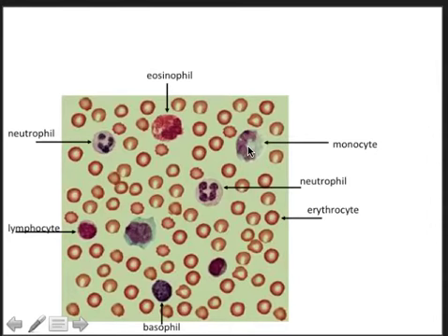There's a monocyte and there is a monocyte, and what they eventually become are macrophages, which are capable of phagocytizing pathogens, chopping them into little pieces, and then displaying them to the immune system, which will become aware of their presence and attack. And then the eosinophil, you can see the red staining granules in the cytoplasm, and also a many-lobed nucleus. These are responsible primarily for fighting parasitic infections, and they also mediate the allergic response.